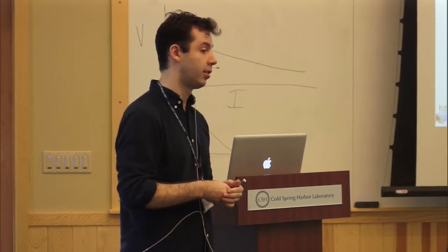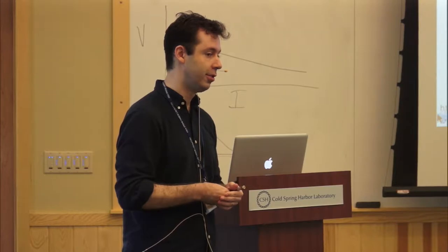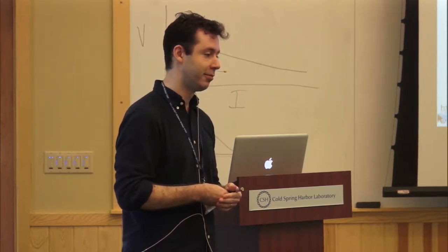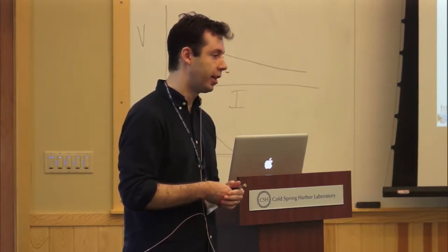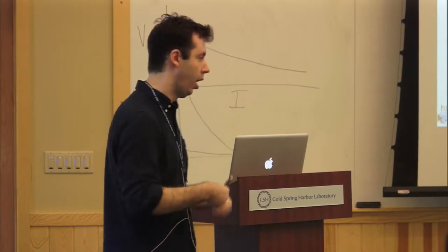If you're doing ChIP-seq, what should you do? Single end or paired end? Single end. Basically single end. You're not getting much by sequencing the two extremities of the same fragment when it comes to ChIP-seq.